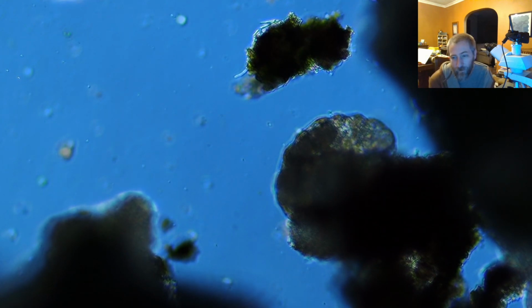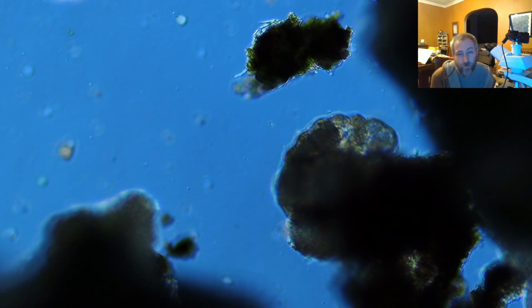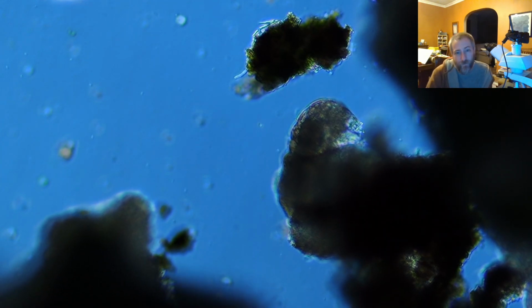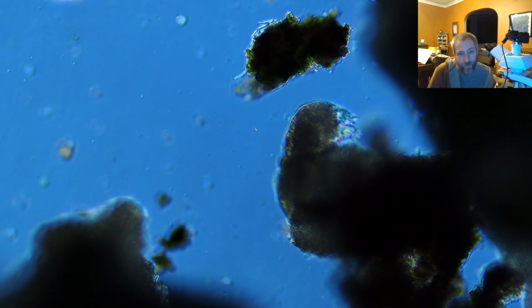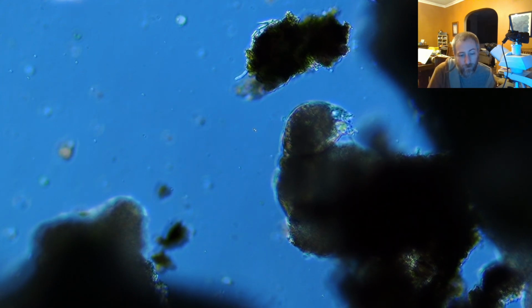Diatoms can definitely be endemic to an area, and in fact, I just published a paper yesterday on a new species of diatom from a lake in California, and as far as we can tell, it's endemic to just that lake. I mean, we haven't looked closely at the surrounding lakes to see if it's also in one of those, but it's definitely not a common diatom, and it's a new species. It's the first time we've seen that thing. Maybe now that we know what to look for, we might be able to find a couple of other places where it occurs. But at least for right now, we think it's probably an endemic diatom species that's new. And I described that species with a couple of my colleagues.